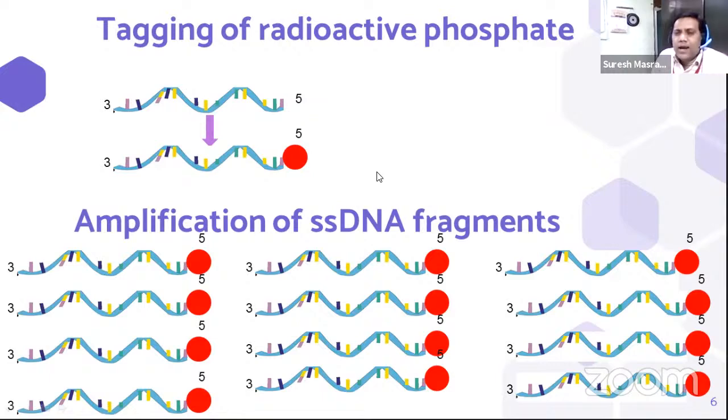Now, when we add everything, the single-stranded DNA is multiplied. It undergoes replication from single-stranded to double-stranded DNA. After a certain period, that double-stranded DNA, under higher temperature and NaOH sodium hydroxide treatment, gets denatured. Thus, we put in the single-stranded DNA, that single-stranded DNA becomes double-stranded DNA, and that double-stranded DNA undergoes denaturation and gives rise to single-stranded DNA.